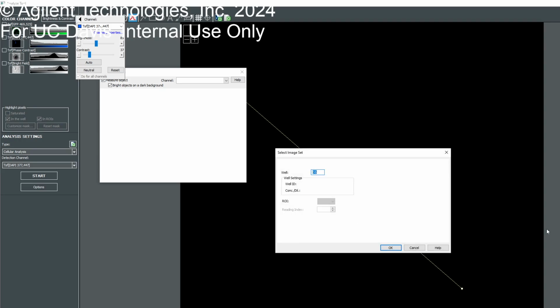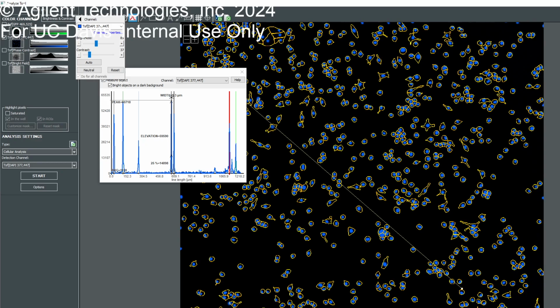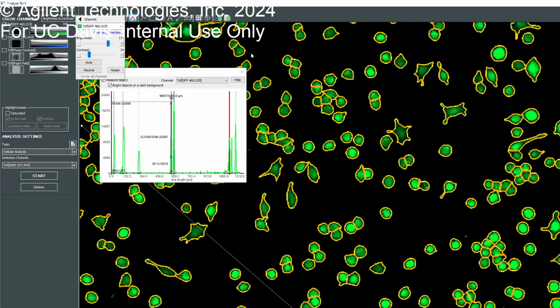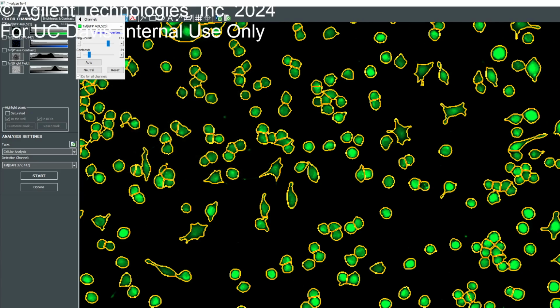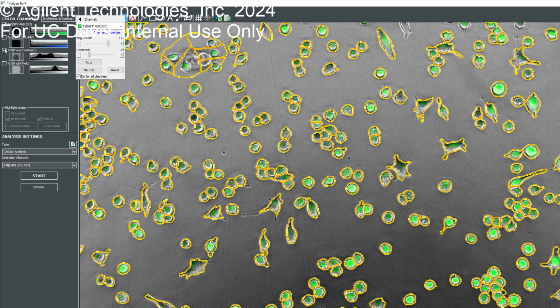Conclude with that image. Any questions? Got some jump, looks like a hair fell in or something. Yeah, there is also some debris here, but it's absolutely fine. You're going to have some locations like that, so it's fine. I just want to kind of see it. No, it is a debris.